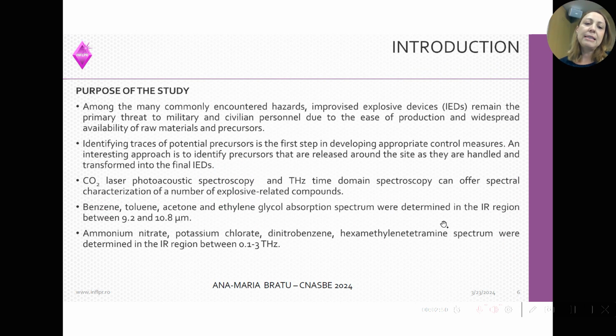The purpose of the study is to use two spectroscopic methods for identification of 8 substances.